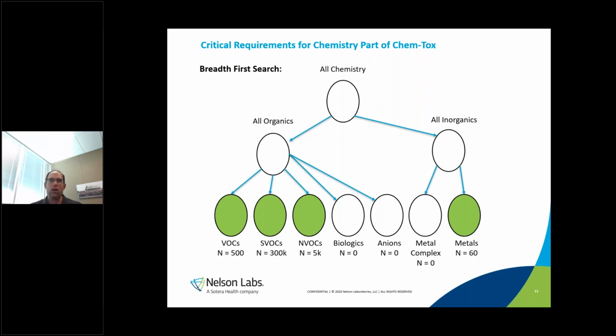Where something like alcohol can sit there and evaporate, you can see it evaporate off. And so the alcohols are more volatile, and so they would be on the volatile organic compound screening, where the lotions and stuff like that would be down on the non-volatile. So those are the screens for organic compounds. And then for inorganic, it's metals, and that's where the ICP-MS comes in.